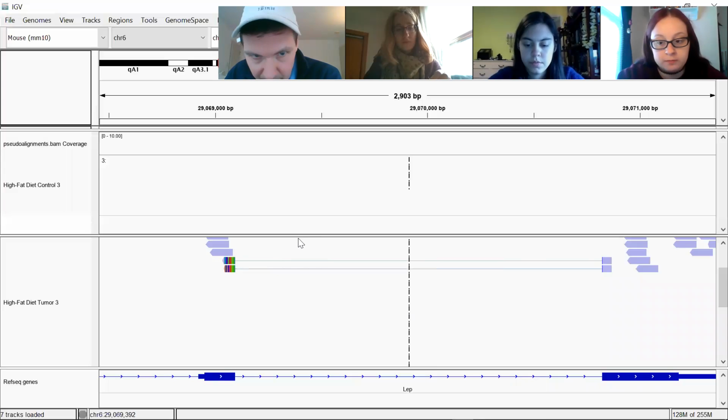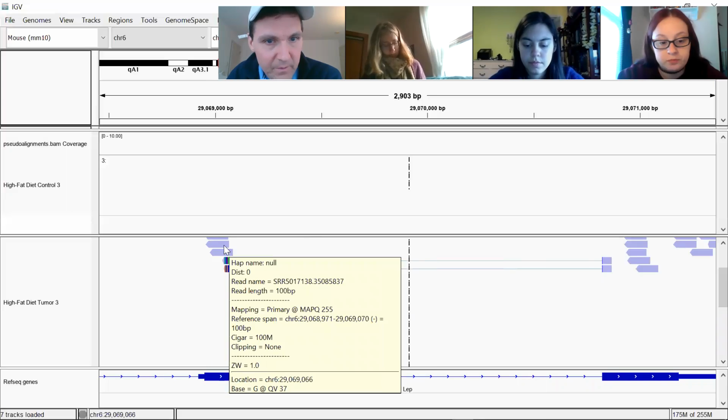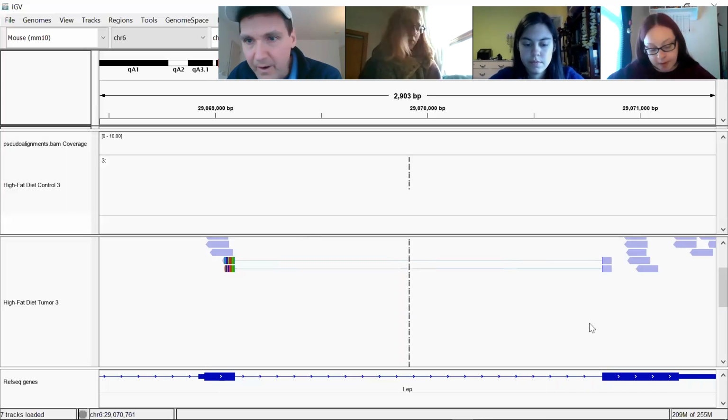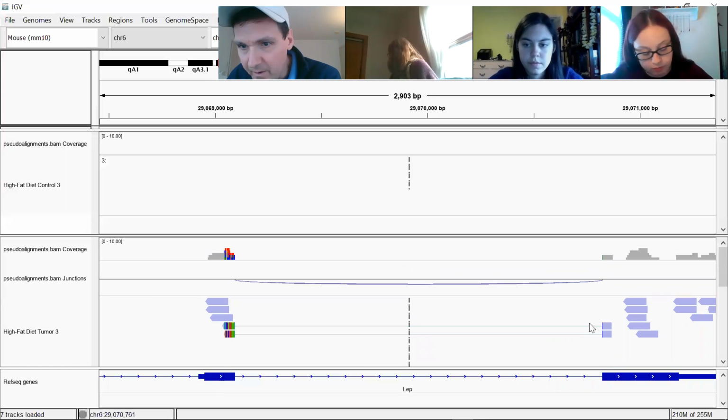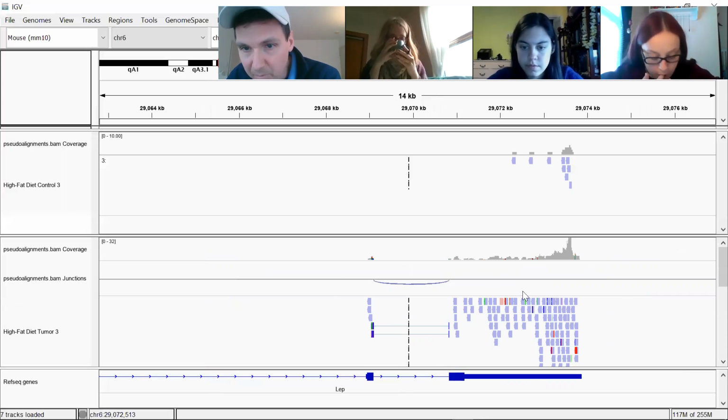Okay. And also the directionality of the reads is, in this case, from right to left, it looks like, because the arrow is pointing from right to left. So the sequencing was directional. They're all from right to left, it looks like, in that orientation. There's no red reads, which would be pointing the other way.